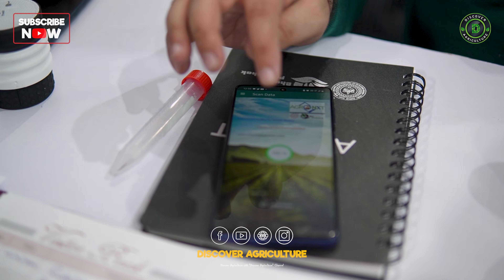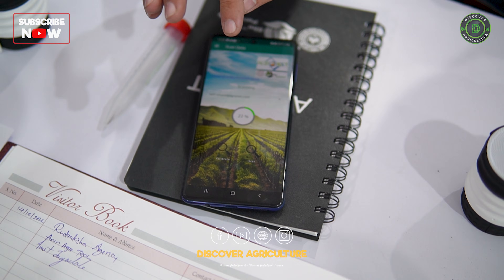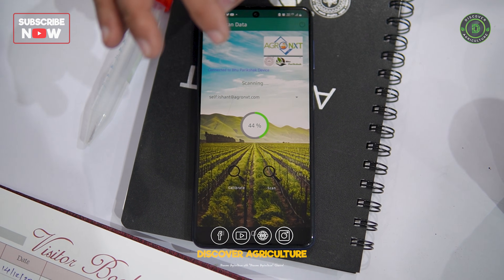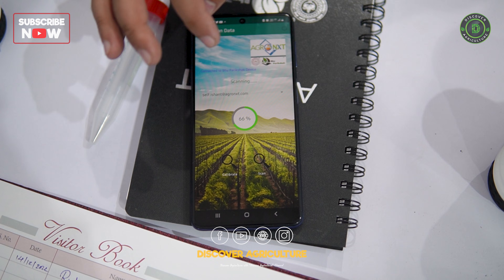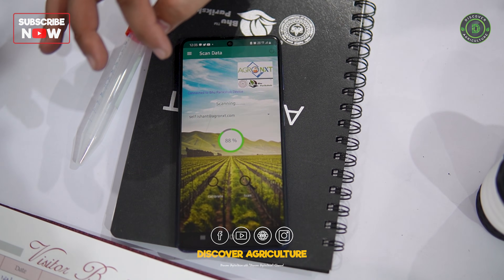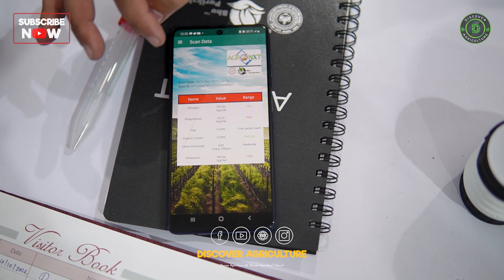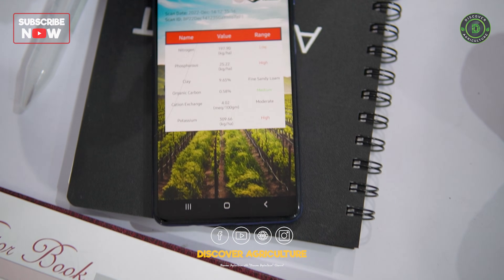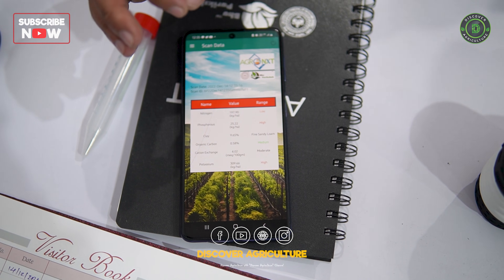Now we just tap on the scan tab in the mobile application and the scanning process will start. You'll see the progress of the scanning as a percentage in the mobile application. Once the scanning is done at 100 percent, an instant soil diagnosis report will appear right on your mobile screen.